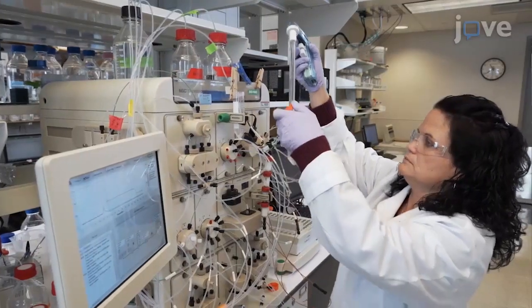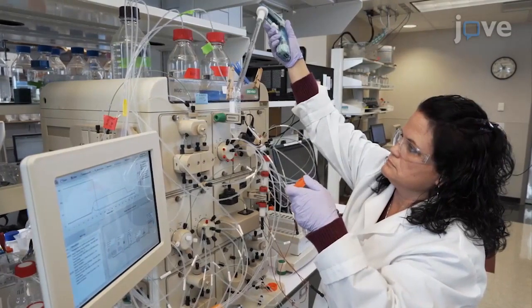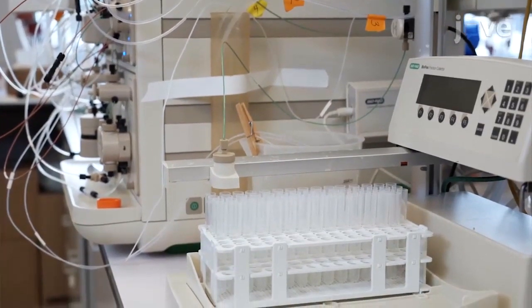Using the proper column and limiting the time the protein is in low salt buffer are essential for success. Understanding that the precipitation is not a snow globe type of event helps guide those new to the protocol. This is reinforced by showing the need to divide the cation exchange column load into multiple smaller loads.